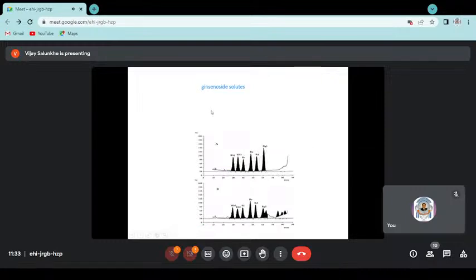For example, ginseng. Ginseng contains various types of glycosides, ginsenosides. All this estimation, qualitative and quantitative analysis, is already done in Anchrom Laboratory. Anchrom Laboratory, Mulund, is a very popular laboratory where different analysts, research projects, MPharm students, PhD students, some co-investigators and principal investigators can do their analytical work on HPTLC, qualitatively and quantitatively.